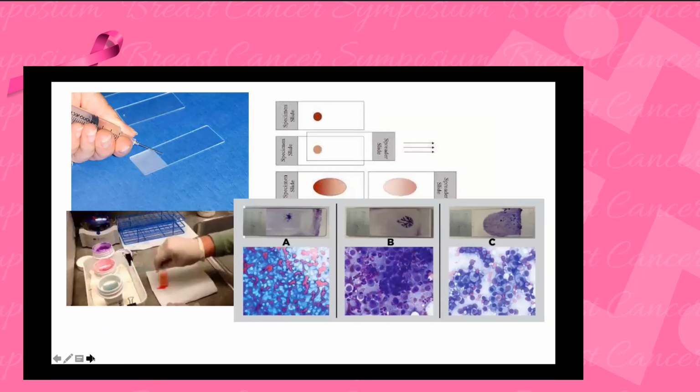Now, I just needed to quickly show this because we still get a lot of cytology samples where FNAs are performed by doctors in their rooms. Now, if you decide that you're going to perform an FNA in your rooms, this is how we need to do it. We don't like seeing blobs on the slides, because clinicians perform the FNA and then they immediately just press the syringe and evacuate the material onto the slide, and then they either fix it or leave it to dry.